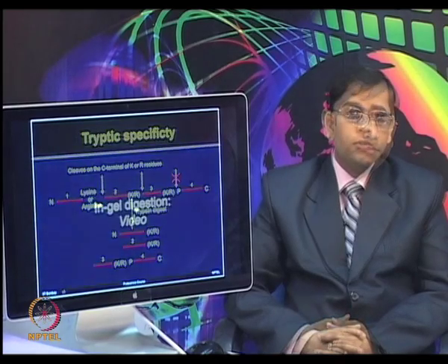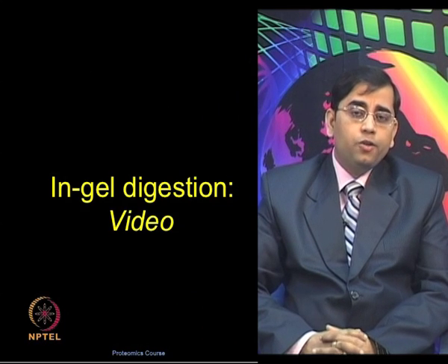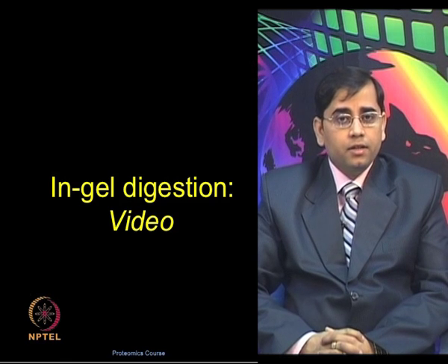The in-gel digestion of proteins isolated by gel electrophoresis remains a core area in mass spectrometry or in any of the proteomics applications. The following video which we are going to watch provides a broad guideline for in-gel digestion.